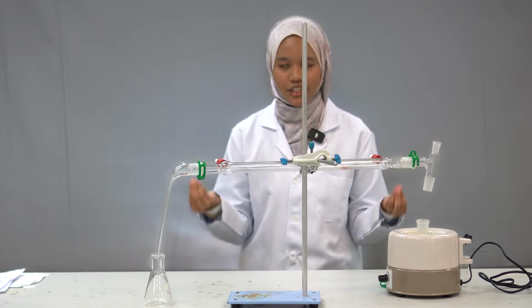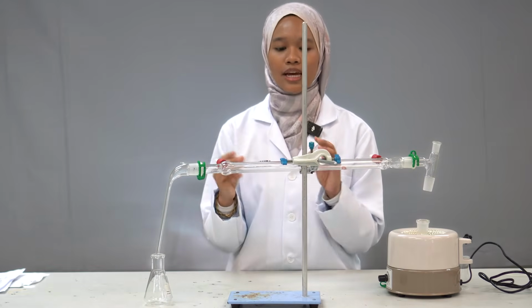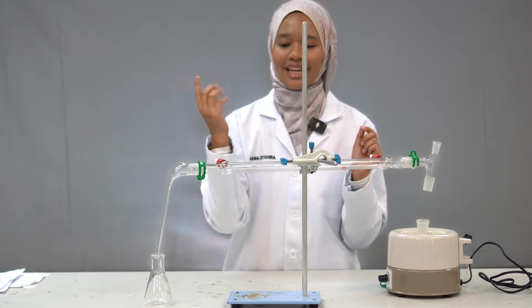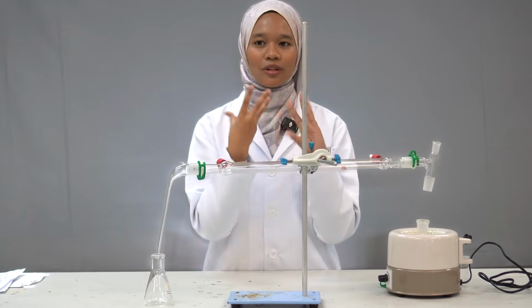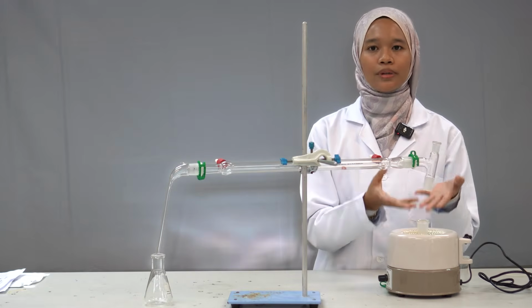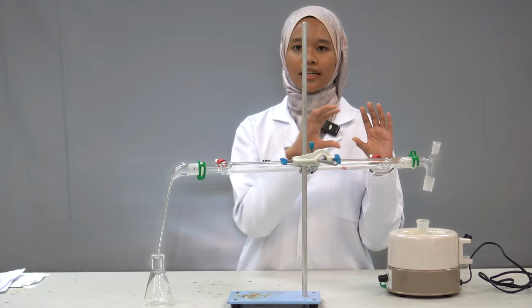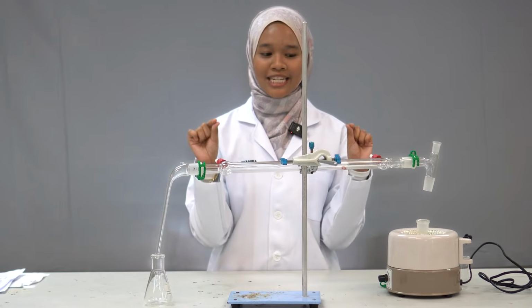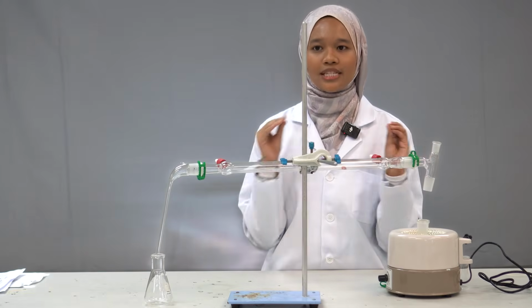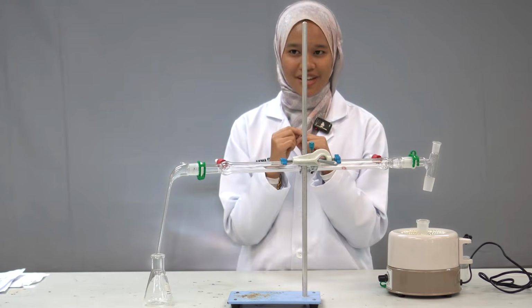So what is the function of the tap water? The function of the tap water is to make sure that the wall of the outer surface stays cool. When we raise the temperature of the mixture, the vapor will form. After the vapor forms, the vapor will flow in the inner surface and contact the cool wall of the outer surface.